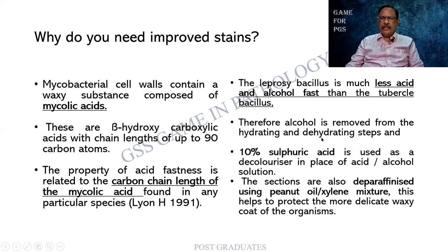Therefore, the alcohol is removed from the hydrating and the dehydrating steps. 10% sulfuric acid is used as a decolorizer. There we are using 1% HCl. The sections are also deparaffinized using this combination. What is this combination? Peanut oil and xylene mixture. So we shall be seeing that.